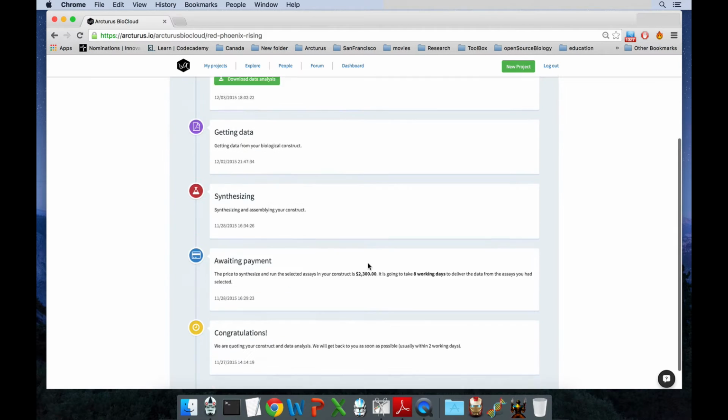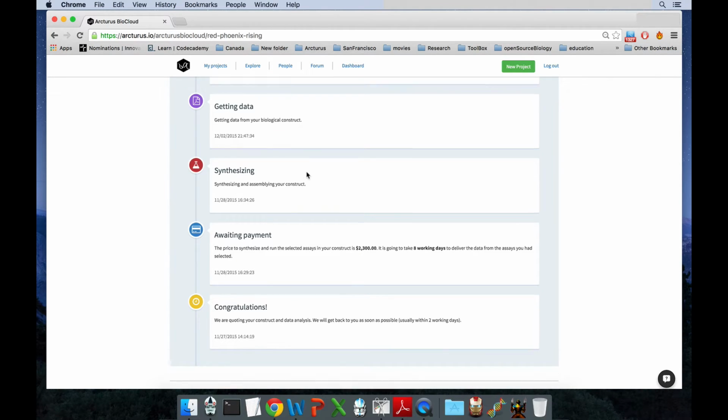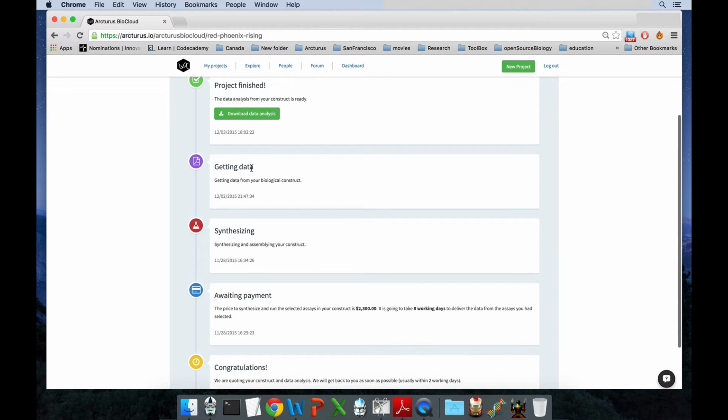So what happens after you submit your project, you're gonna get the quotation of your project. We're gonna tell you how much it's gonna be, and after you pay, we're gonna synthesize your DNA, the construction that you send us, and we're gonna develop the experiments. And here you can get your results.